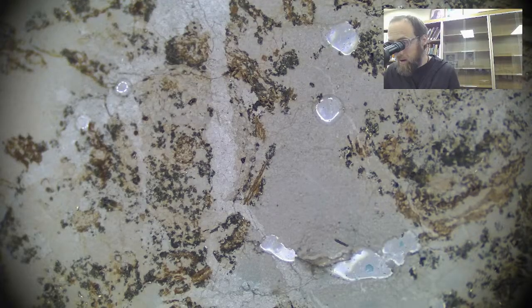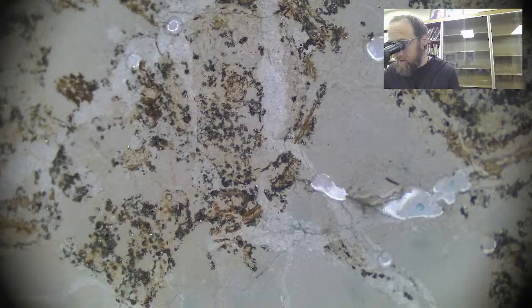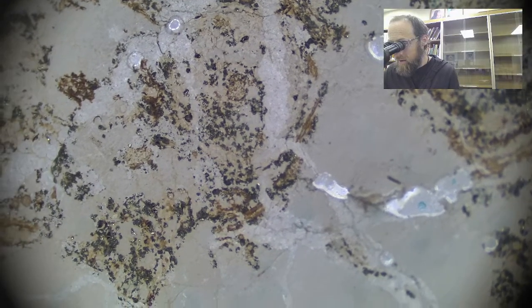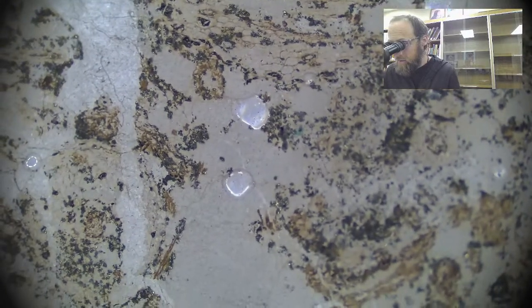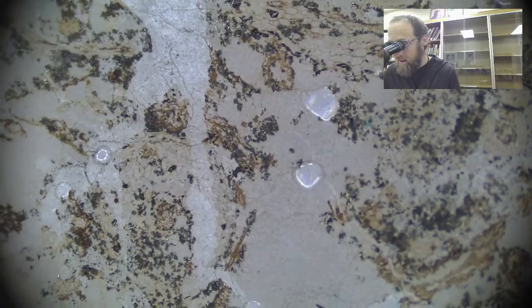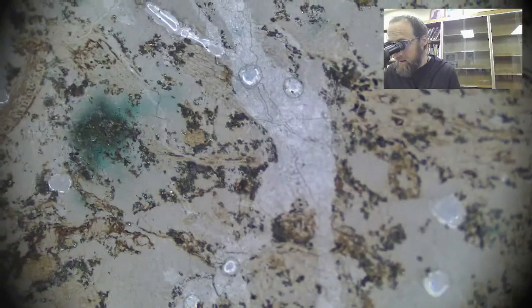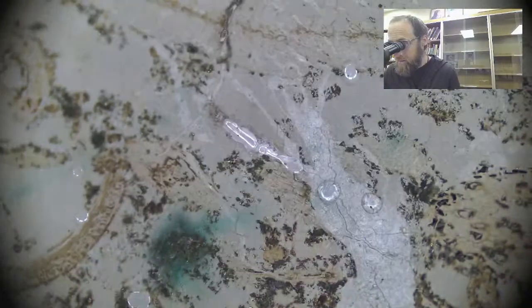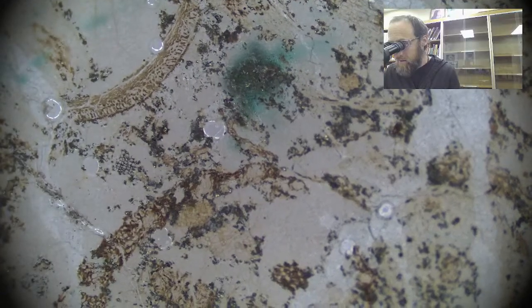Thread or filament kind of things. It always makes me wonder if it's part of an insect, but not holding my breath for that. And I'll just call that inconclusive. So yeah, it's hard to keep track of what you're doing when it's like, well, I looked here and I couldn't figure it out.